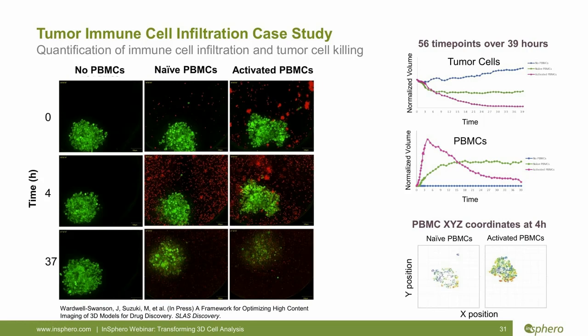Now that we've demonstrated the feasibility of conducting 3D in vitro IO studies in real time, our next steps are to examine the infiltration of specific immune cell types that either mediate or suppress tumor cell killing. Ideally, this would include modeling of antigen-specific immune response or adaptive responses, and ultimately we plan to use these 3D tumor models, as well as 3D tumor models derived from patient tumors, to evaluate IO therapeutics and combination therapies in 3D in vitro studies and in real time.